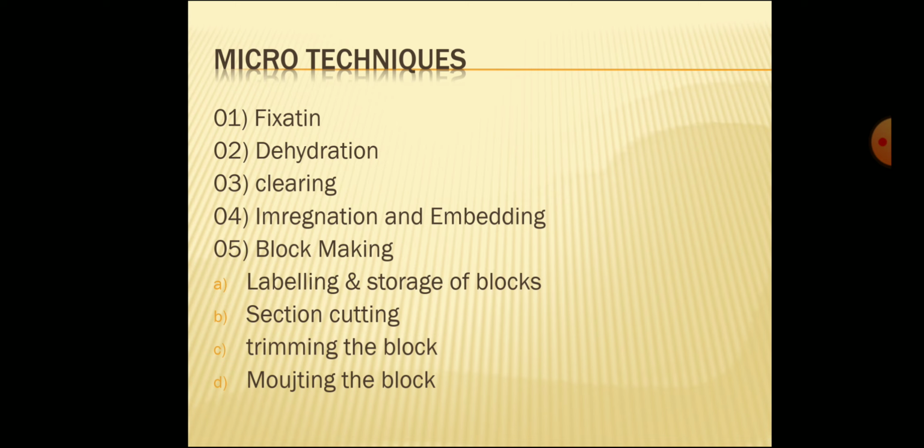The paraffin block containing the material is held against light so that the outlines of the material can be seen clearly, and then trimmed until the material lies in the center of a perfect rectangle with the major axis of the material. While trimming, care should be taken that the block is not cracked and the material is neither exposed nor remains covered with a very thin layer of wax.